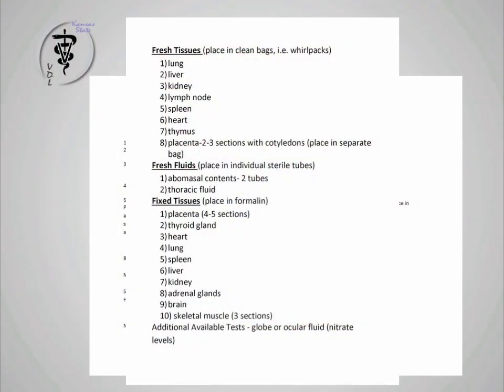Pretty much it on this slide. So like I said, thoracic fluid or pericardial fluid or heart blood, we can use those all the same. And that is just as easy to put in a red top tube as well, or if you use the clear Falcon tubes with the snap tops, whatever you typically have for supplies are fine.